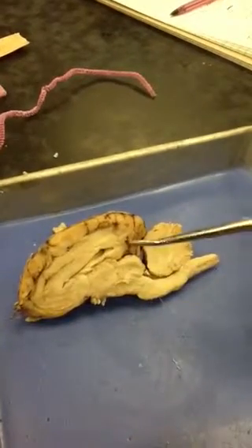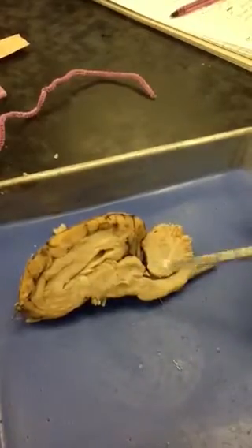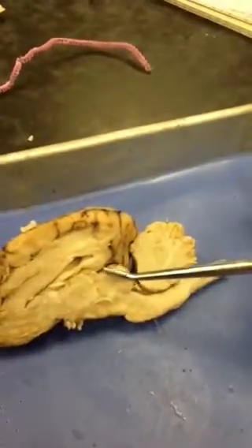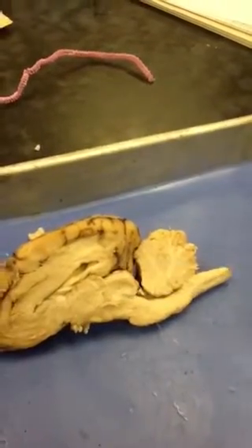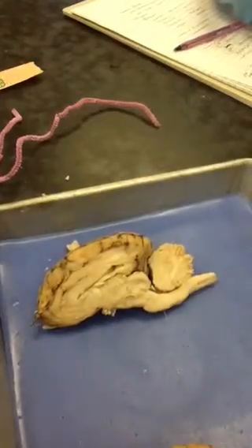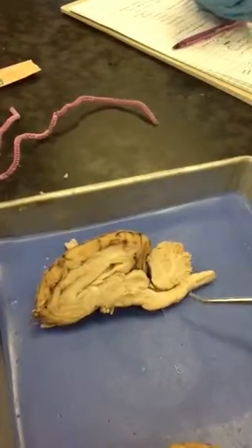And then the pineal gland is this darker structure right here. It's the one that regulates melatonin, or your sleep cycle. And okay, so then we move on.